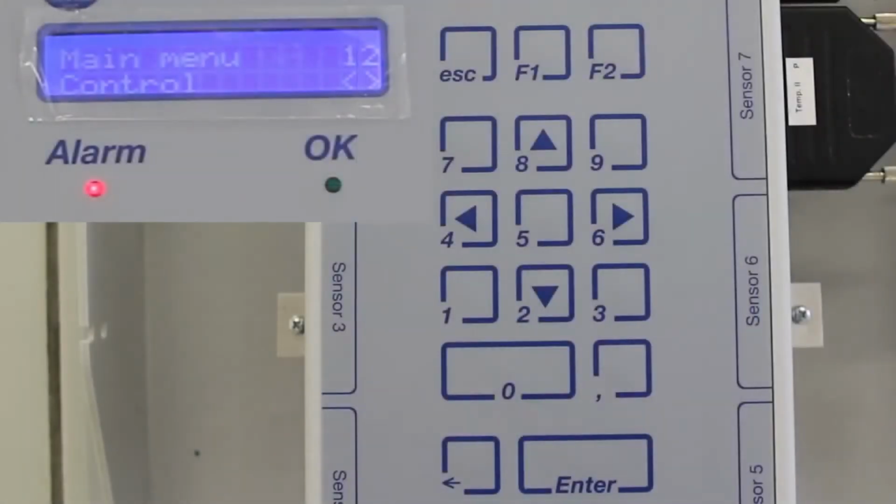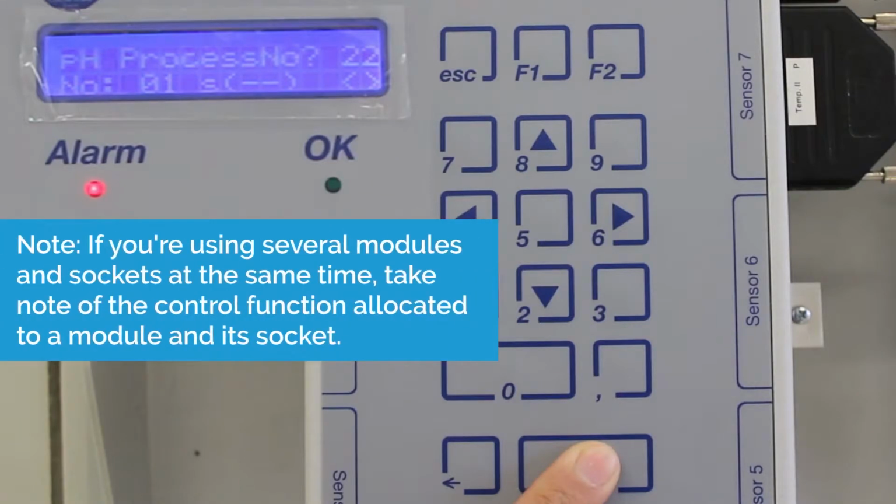In the main menu level, select the menu Control. Now, select pH value. If you have connected several pH modules, you can press the arrow keys to select the desired module. Don't forget to make notes.